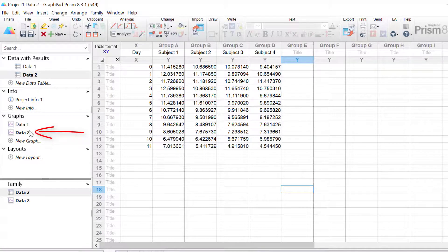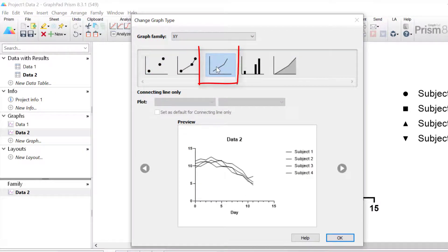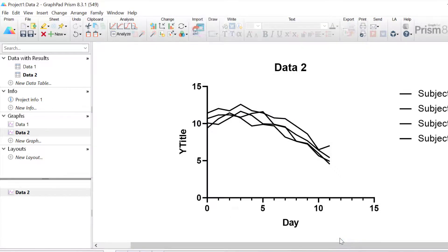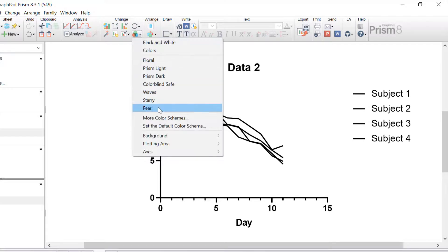I'm going to click on the connected graph sheet in the left hand window, and this time with the X, Y graph selected I'm going to select the connecting line only option and then click the OK button. This is the basis of our new spaghetti plot. Again it's in black and white, so let's quickly add some colour by going to the change colours option at the top and selecting the pearl theme.